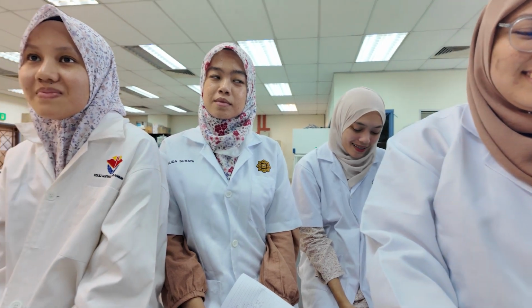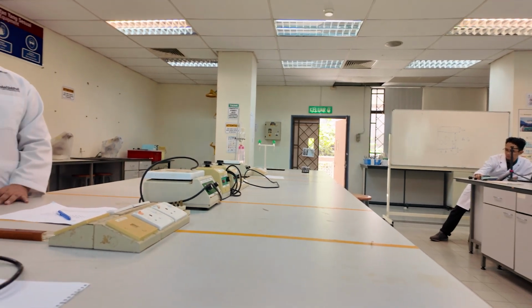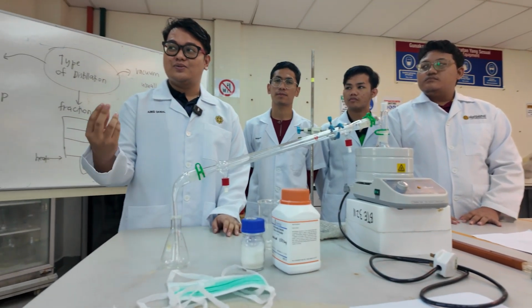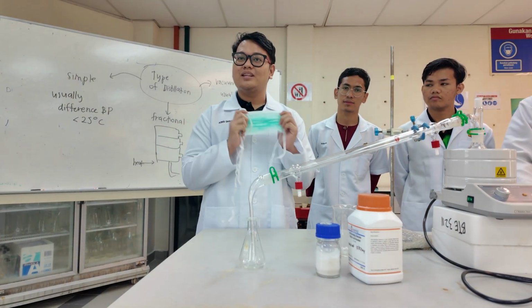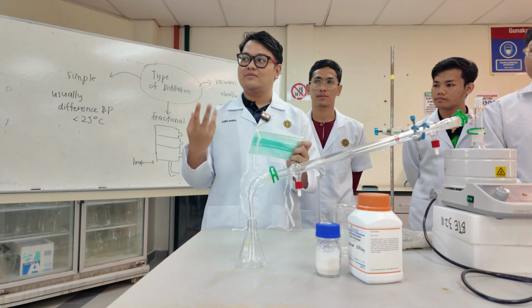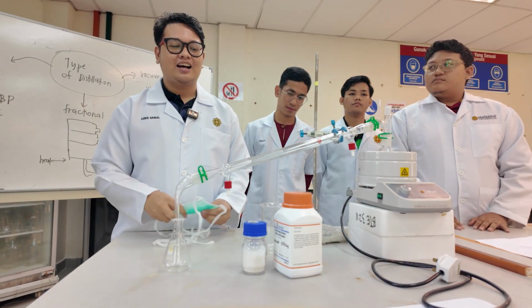The meaning of volatile is that the solution will evaporate faster into the air. So the precaution is we always need to wear a mask when dealing with volatile solutions so that we don't inhale the vapor. It will protect our lungs for our lifetime.